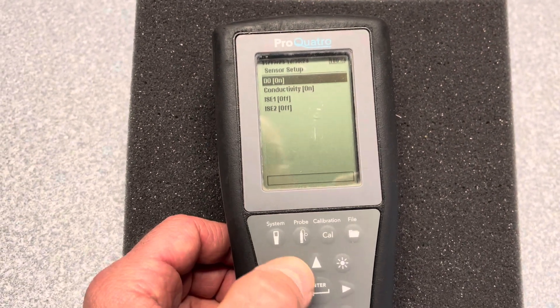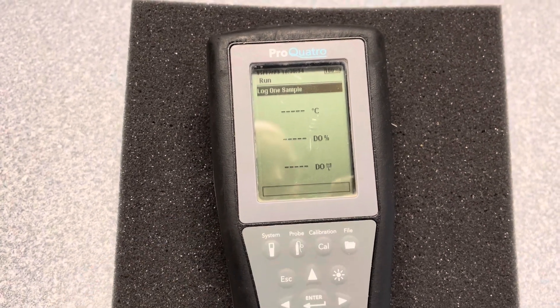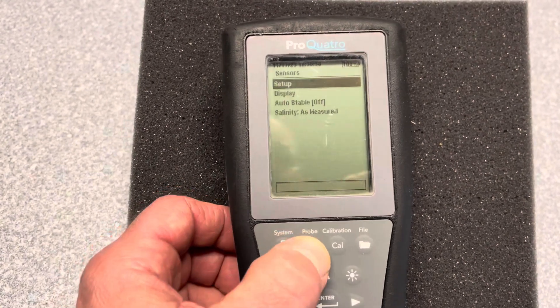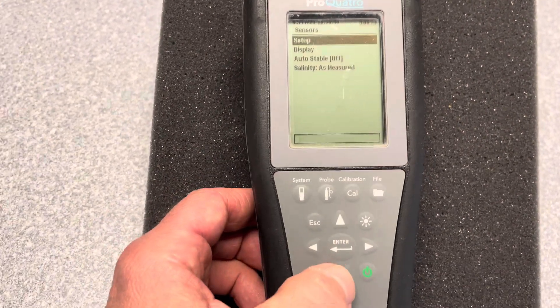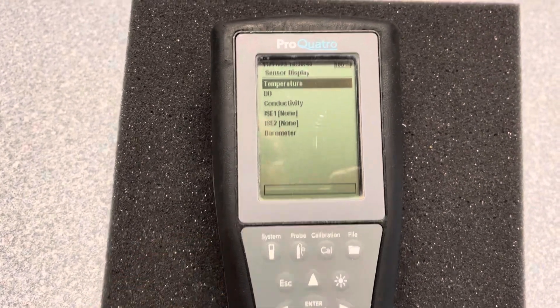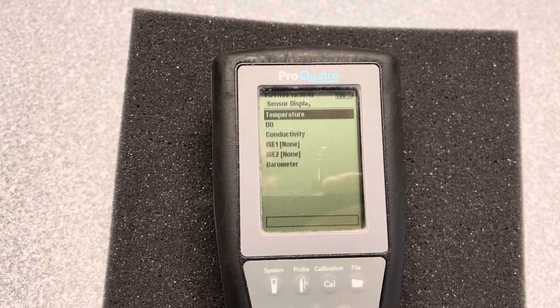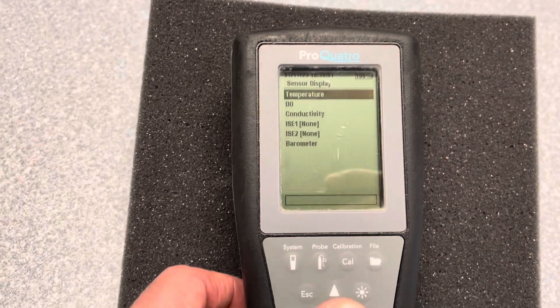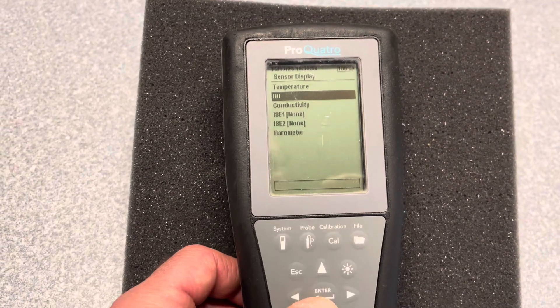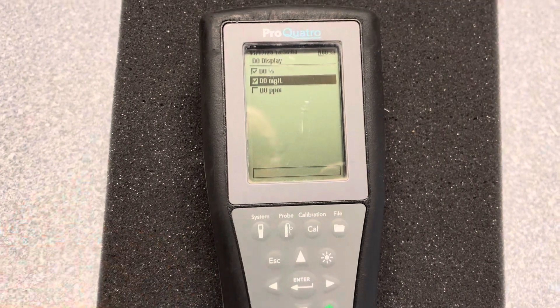The other thing we want to do — when we hit Escape — is how to change the mode of the sensors that you have. We're going to go back and hit the Pro button, and then this time we're going to go down to Display. We're going to select the parameter that we want to change the mode on. In this example, I'm going to go down to DO and hit the Enter button. Here you have three options.